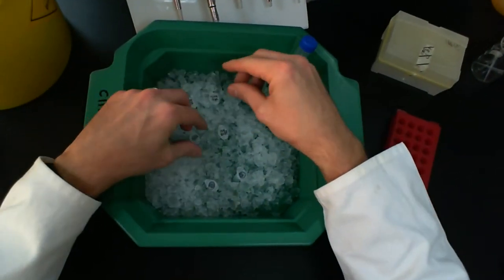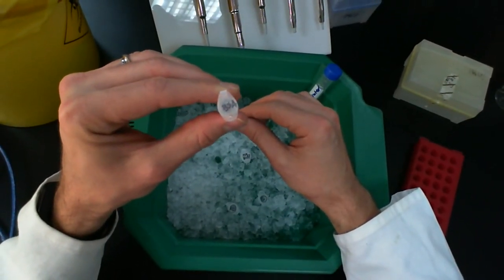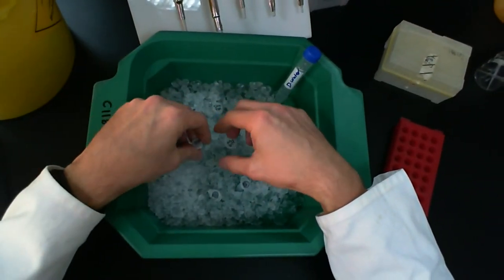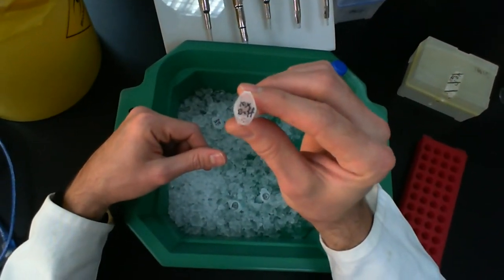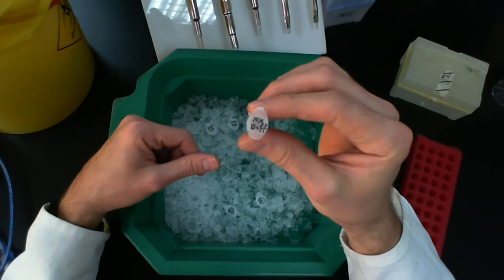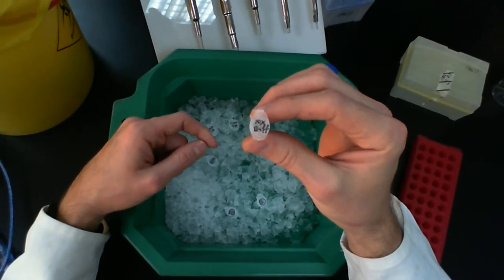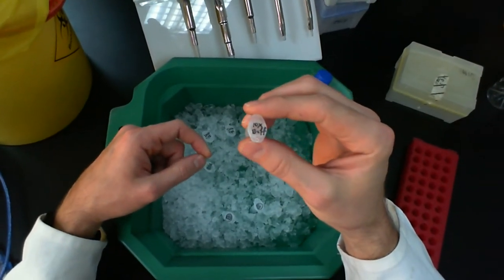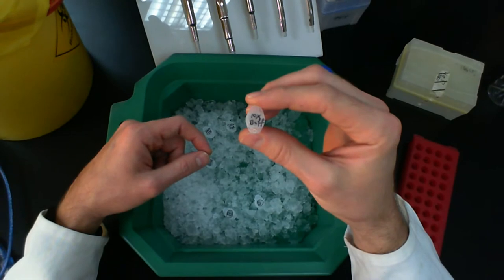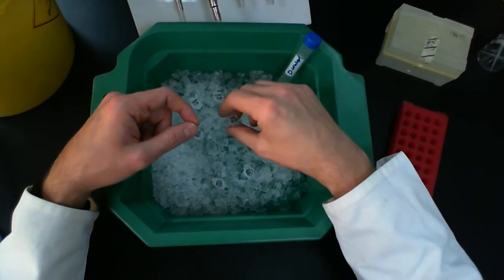You also have a sample tube that contains some BSA, which is required for the enzymes to function properly in this case. You also have a sample of 10x buffer. This buffer is going to be used for both of your enzymes, so we just have one of these tubes. Some enzymes do not have compatible buffers, so in those cases you may need to do digests with two separate buffers. In this case we have two enzymes that work well in this buffer, so we're using the same one just for simplicity.